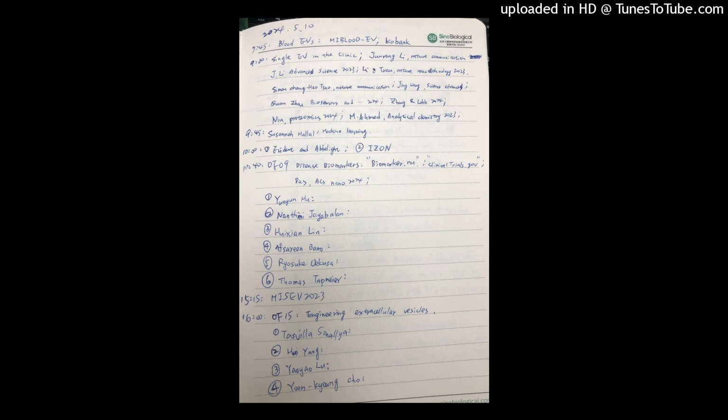I can give you the example of flow cytometry. In 2018, we published an inter-lab comparison study showing that no flow cytometer was able to measure any particles below 300 nanometers or so, or only one instrument out of 20 or 30. Since then, because we have been working on calibration and standardization, we now give summer courses on how to calibrate an instrument. Now, people from the companies are coming to our summer course to learn how to calibrate the instruments, but they have also invested heavily in the last couple of years in making more sensitive instruments.